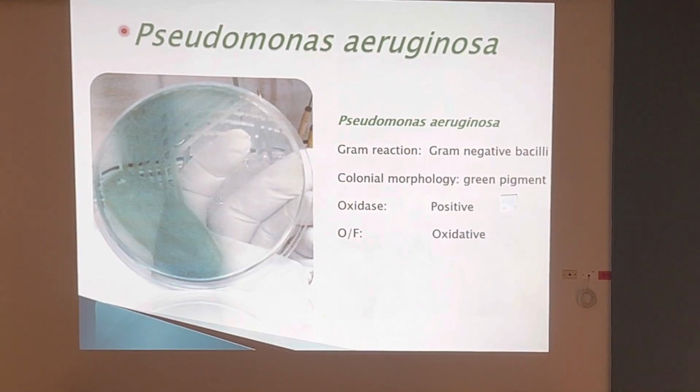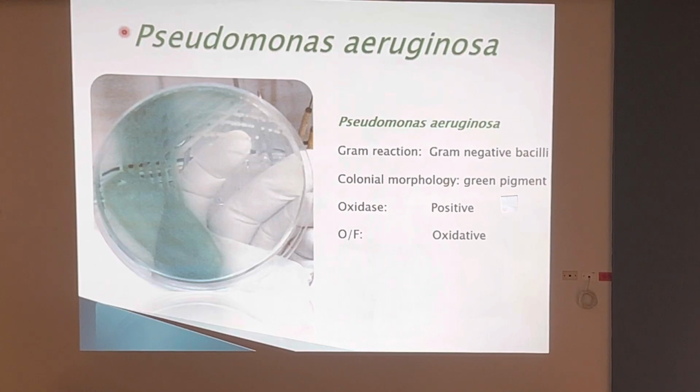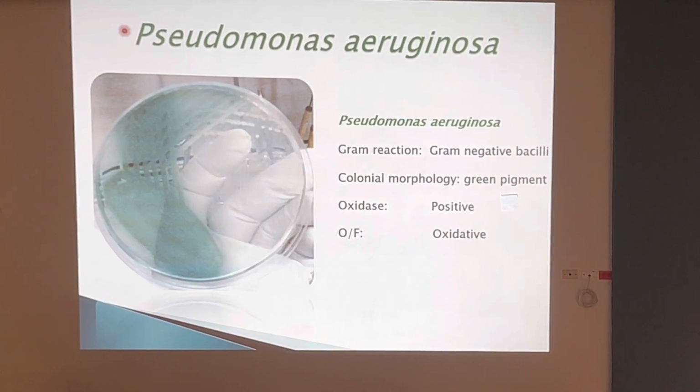Next up is Pseudomonas aeruginosa. Now, Pseudomonas aeruginosa is a gram-negative bacilli, all right?